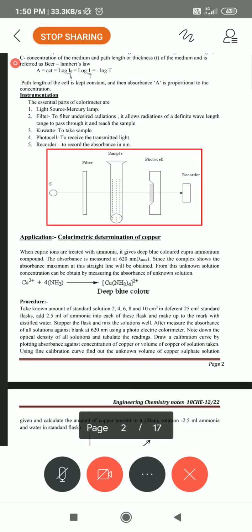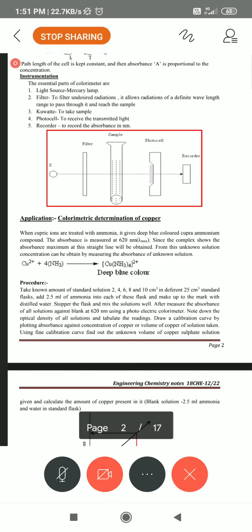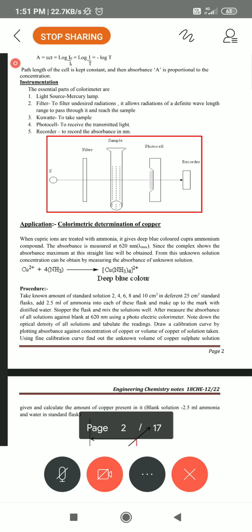This is the confirmation. Suppose 4 gram was dissolved; then, taking 10 ml, instead of 0.30 absorbance you will get a 0.15 absorbance. That very clearly indicates 4 gram of copper sulphate is dissolved. So 1 ml is 0.75, you will get it. In the same way, we can go into the estimation of percentages also.